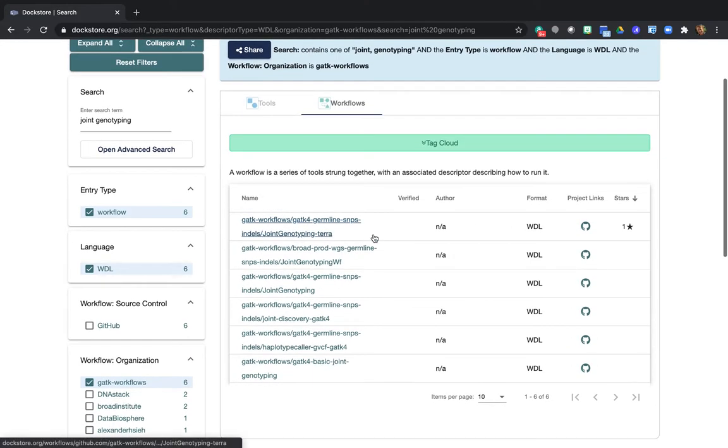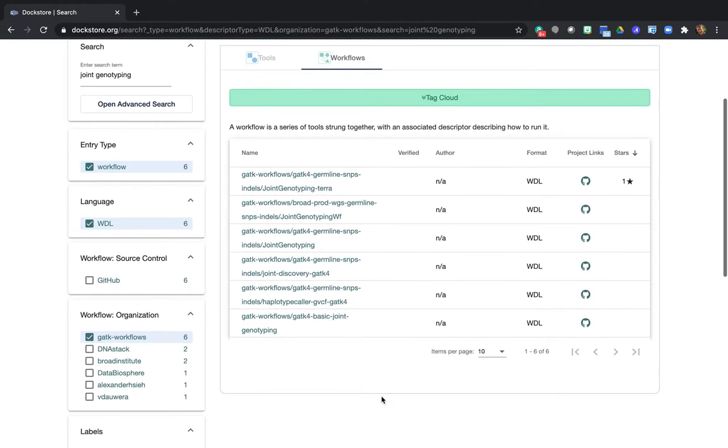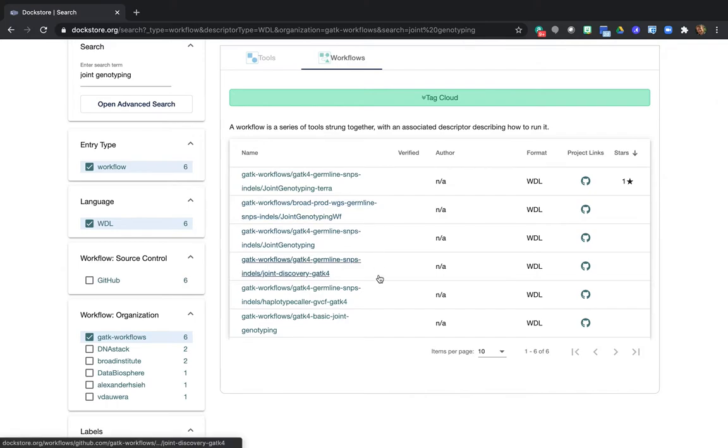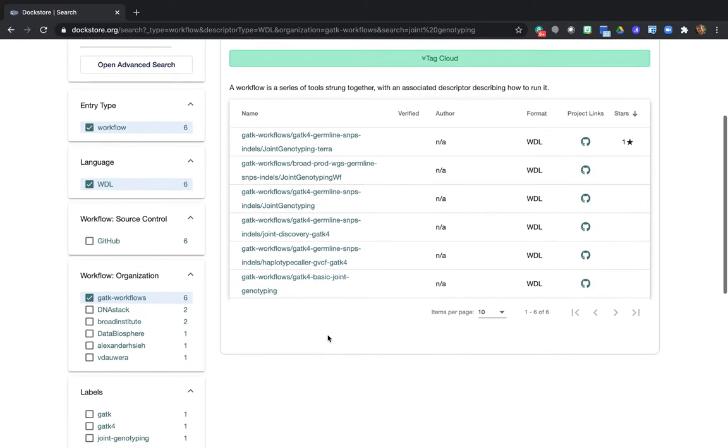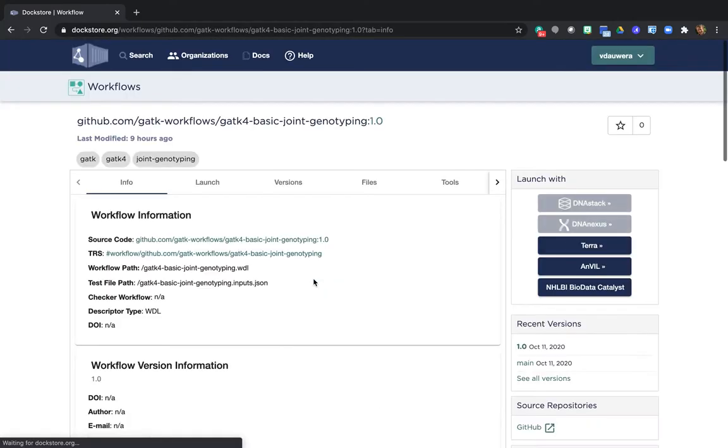Now that still leaves us with several options for joint genotyping. And we are going to want the one that has basic in the name down here at the bottom. So click on that.